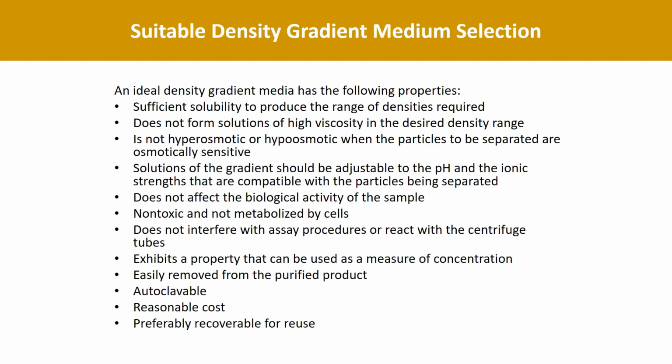So what about isopycnic separation? There, the function of the gradient material is that the maximum density of the gradient media is higher than that of the particle. Okay, then only separation will occur. So therefore, let us look at what are the characteristics of an ideal gradient material.